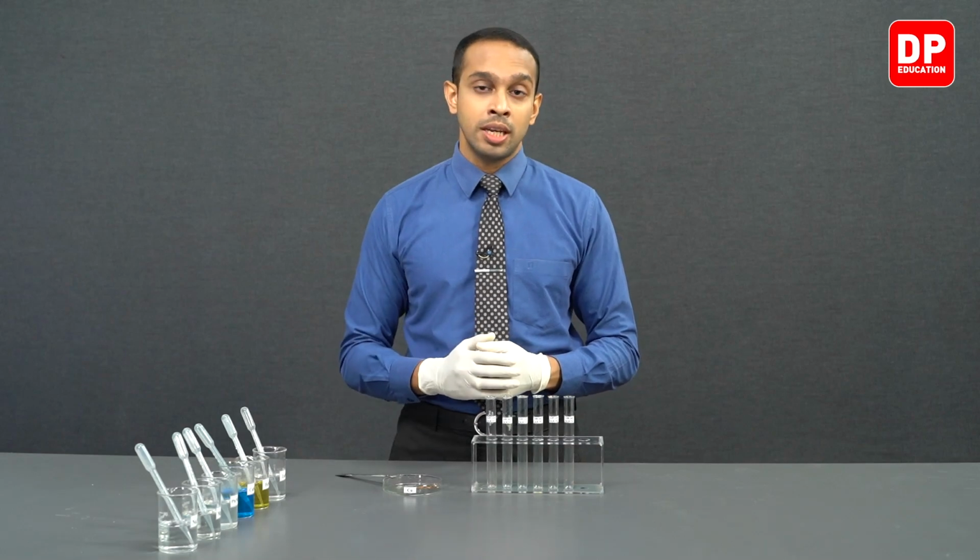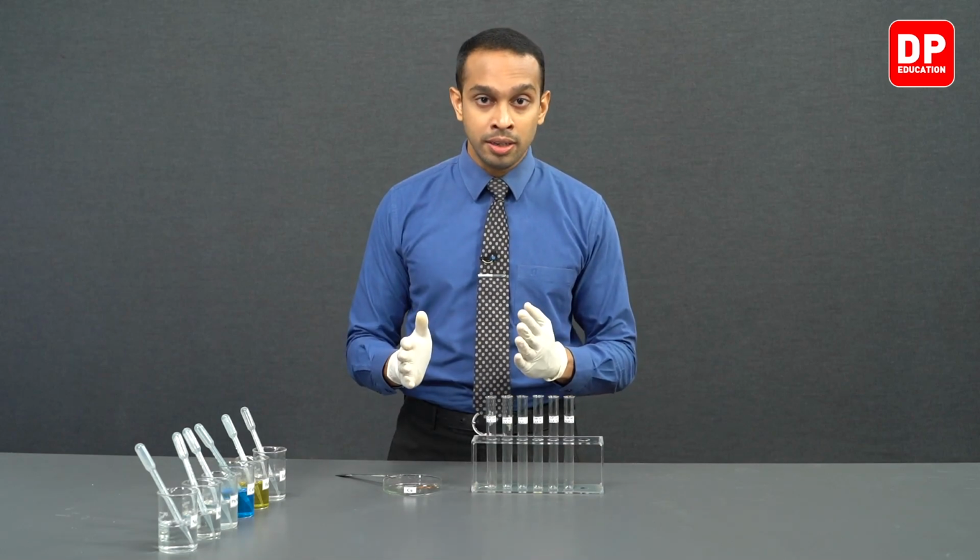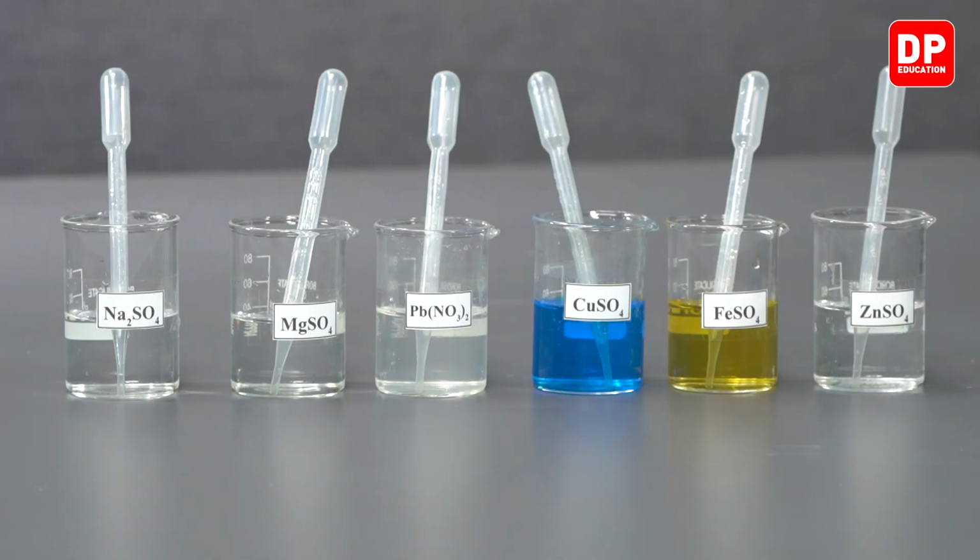Zinc sulfate contains zinc 2+ metal ion, ferrous sulfate contains Fe2+ metal ion, copper sulfate contains Cu2+ metal ion, lead nitrate contains Pb2+ or lead 2+ metal ion, magnesium sulfate contains magnesium 2+ metal ion, and finally sodium sulfate contains sodium 1+ metal ions.